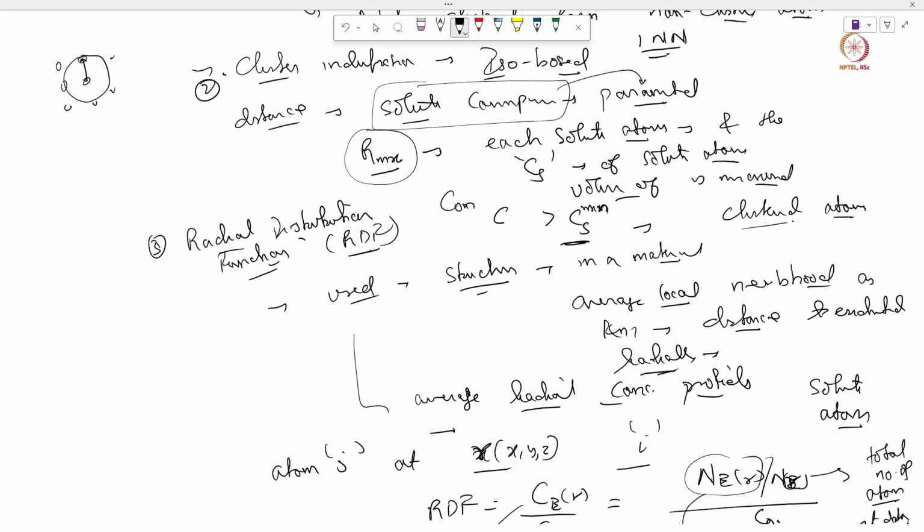So with this I will end this class now, and we will continue with this topic with certain other distribution maps which are very important to understand the crystallography or the interatomic spacings, correct? And also we will cover the effect of detector efficiency on these cluster analyses. We'll basically cover these topics. Okay, thank you.